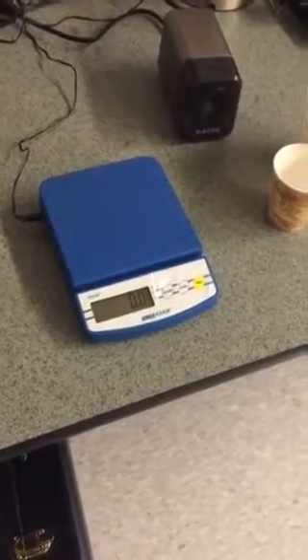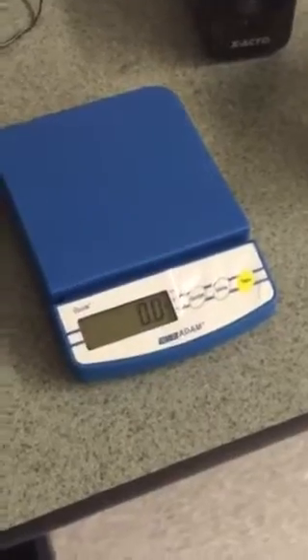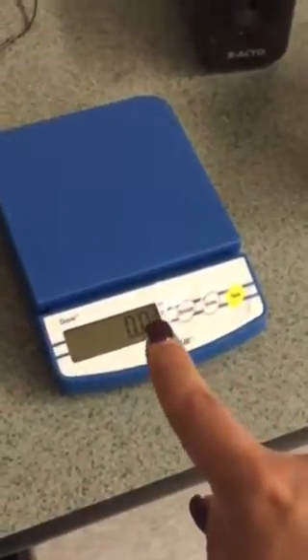Ms. Soleri here, demonstrating how to use a digital scale with the tare button feature. Notice that the scale has been powered on and that the arrow is pointing to the gram feature, meaning we don't have to hit the unit button to reset.